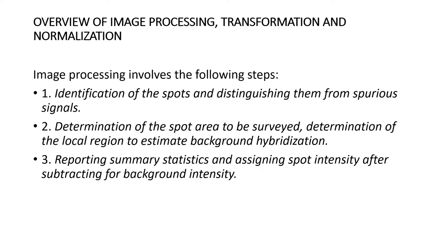There are different sources of error: contamination, beam positioning, and other issues, and density issues. So the spots may be defective and may not be in the similar format. We have to discard the spots that are not homogeneous. Today we will learn this method, how we can discard them.